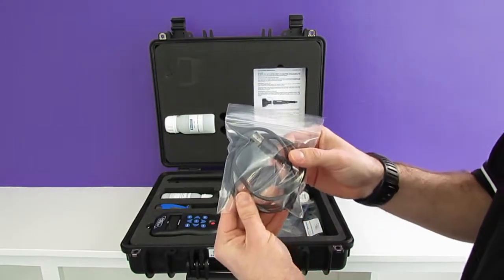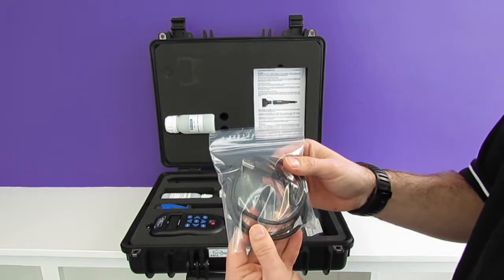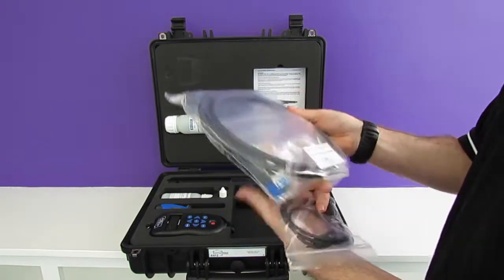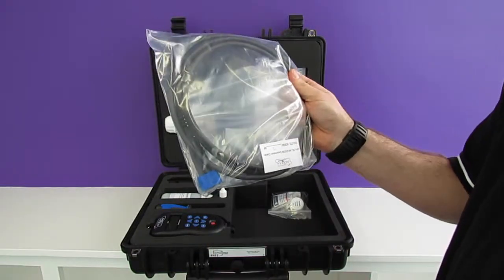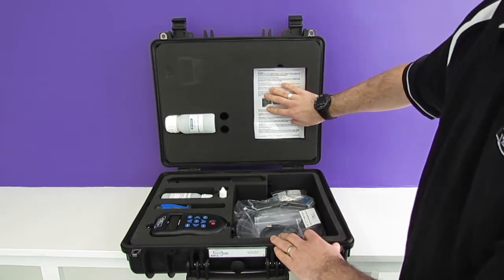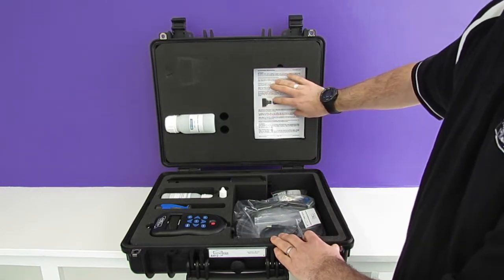Included in the package as well, we have the USB cable to allow you to connect the GPS aquameter to your laptop, and we have a three meter cable complete with the aquacon connectors. Finally we have some getting started cards just to help you get going on your first use.